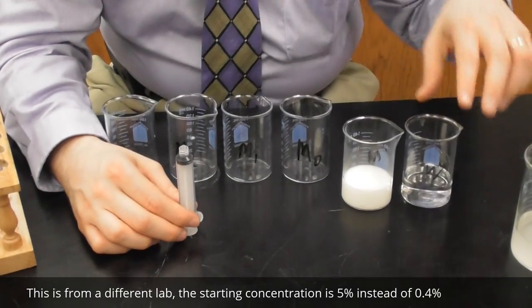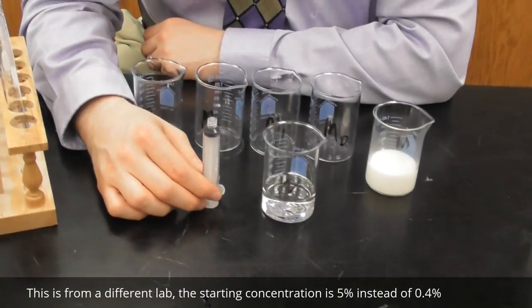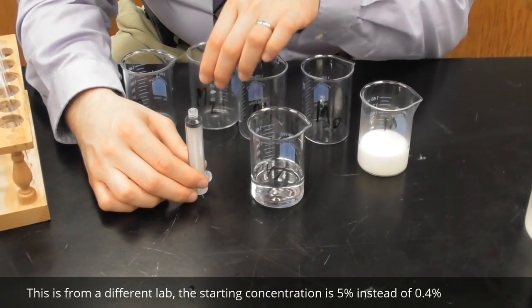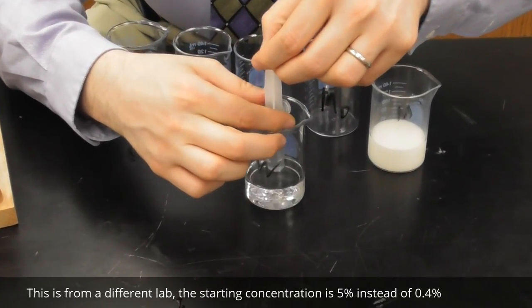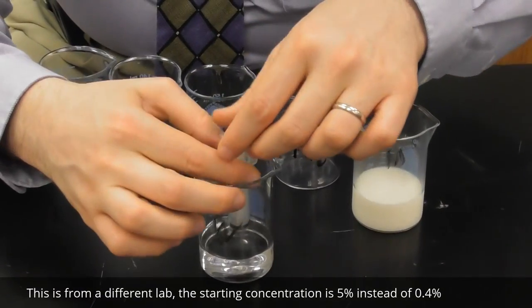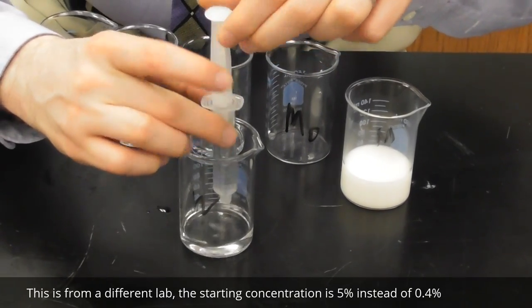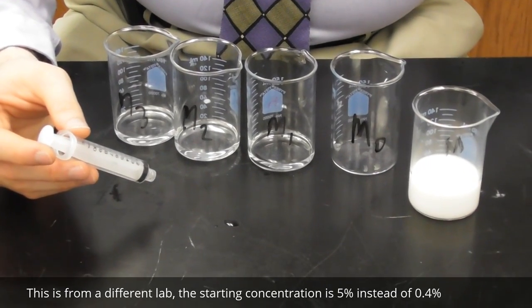Now, first step, I'm not going to deal with the milk first. I'm going to deal with water first. I know what I need. I need 10 cubic centimeters of water in serial dilution step 1, M1, M2, and M3. So I'm going to take 10 of water into M1, 10 of water into M2, and 10 of water into M3. I am now done with water.